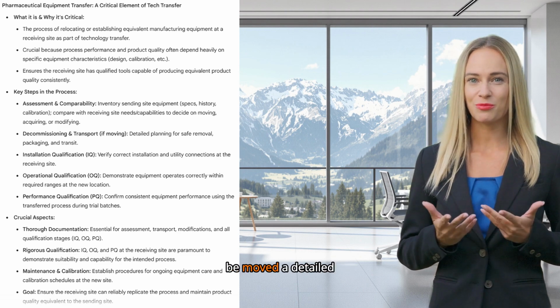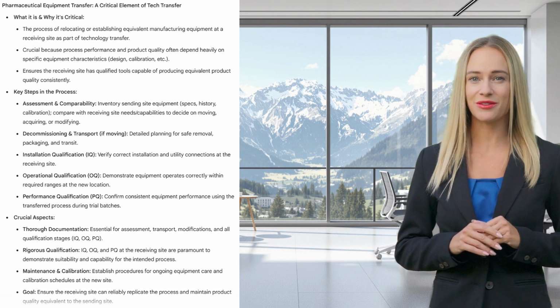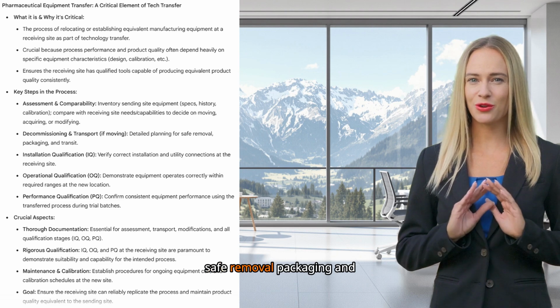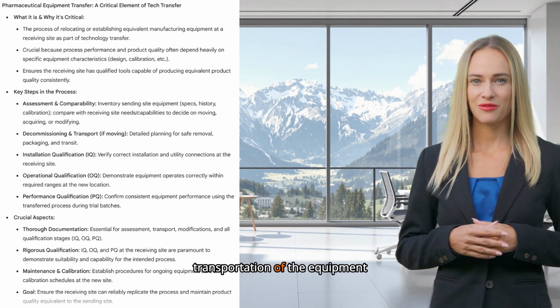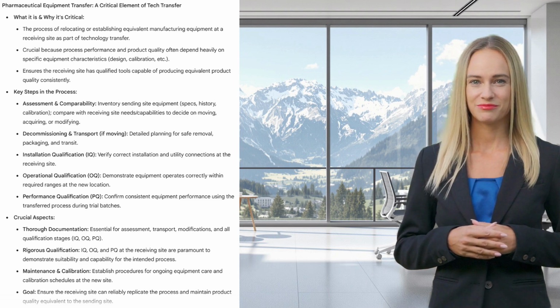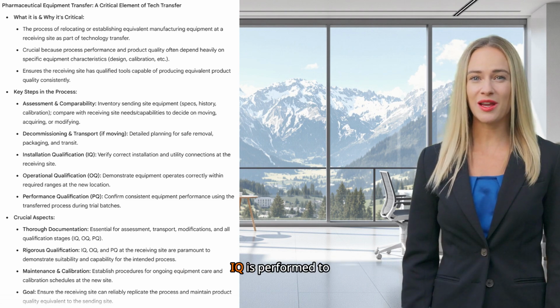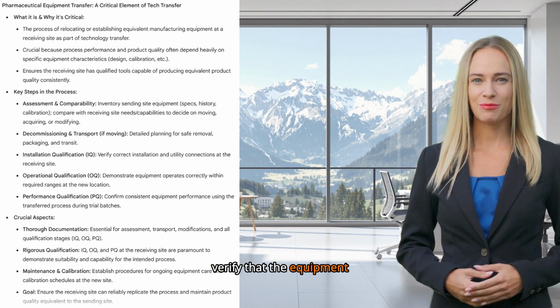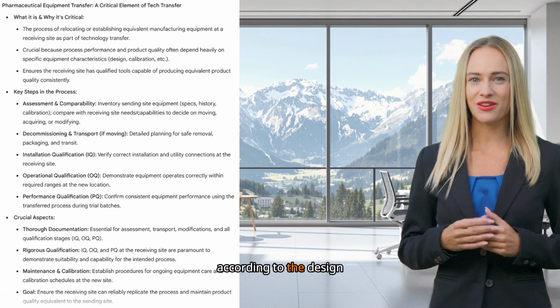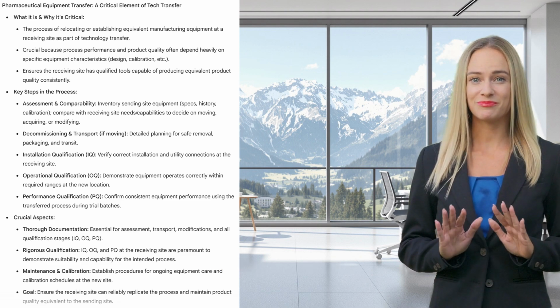If equipment is to be moved, a detailed decommissioning and transportation plan is developed. This plan addresses the safe removal, packaging, and transportation of the equipment, ensuring it is protected from damage during transit. Upon arrival at the receiving site, installation qualification, IQ, is performed to verify that the equipment has been correctly installed according to the design specifications and is connected to the appropriate utilities.